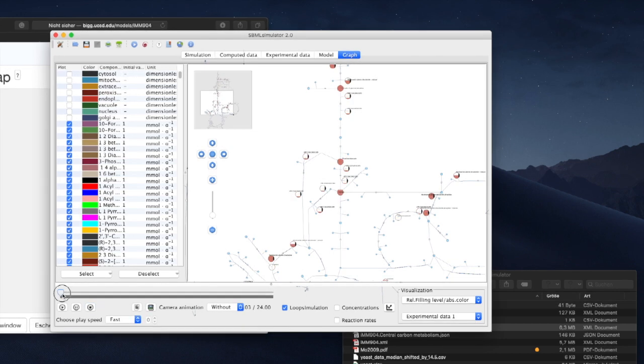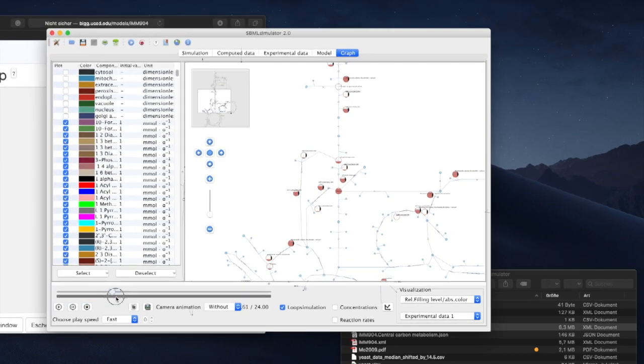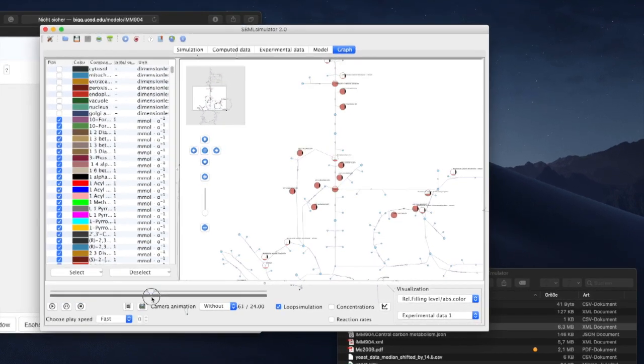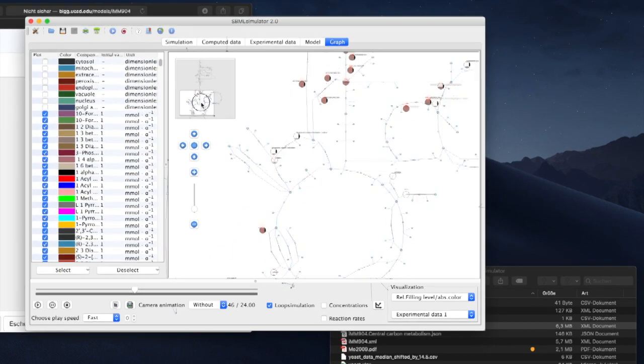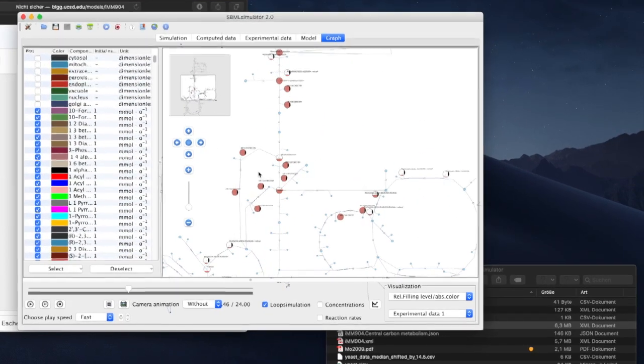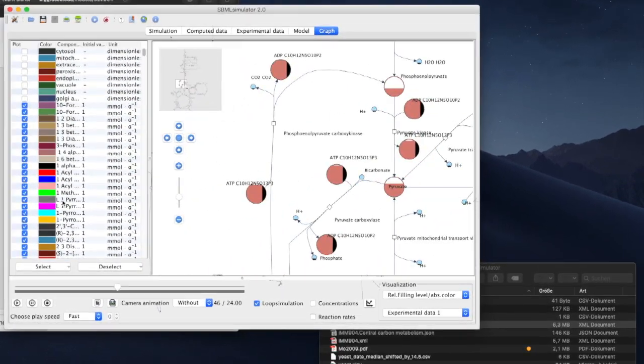We can zoom in and use the slider at the bottom to move to time points during the animation that we are most interested in.